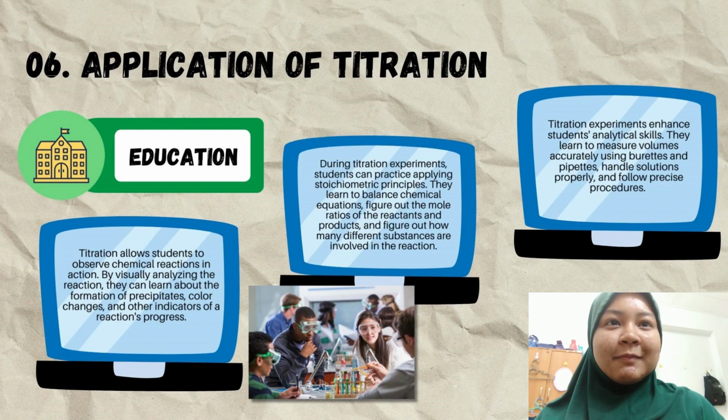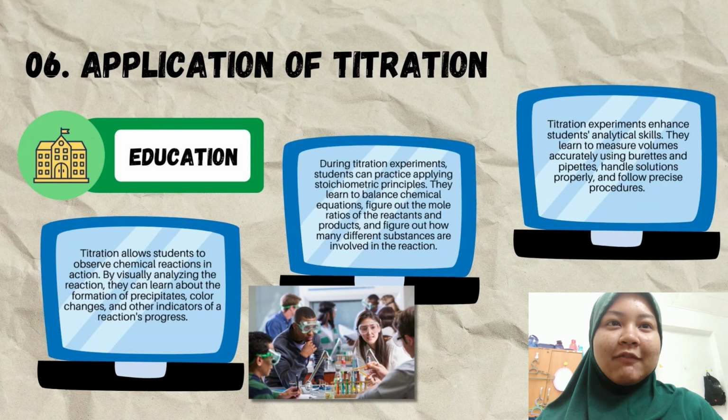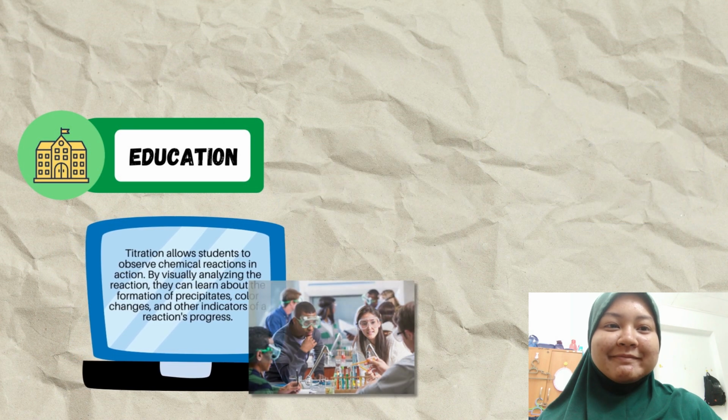Titration experiment enhance students' analytical skills. They learn to measure volumes. They learn to measure volume accurately using burettes and pipettes, and handle the solution properly and follow the precise procedure.